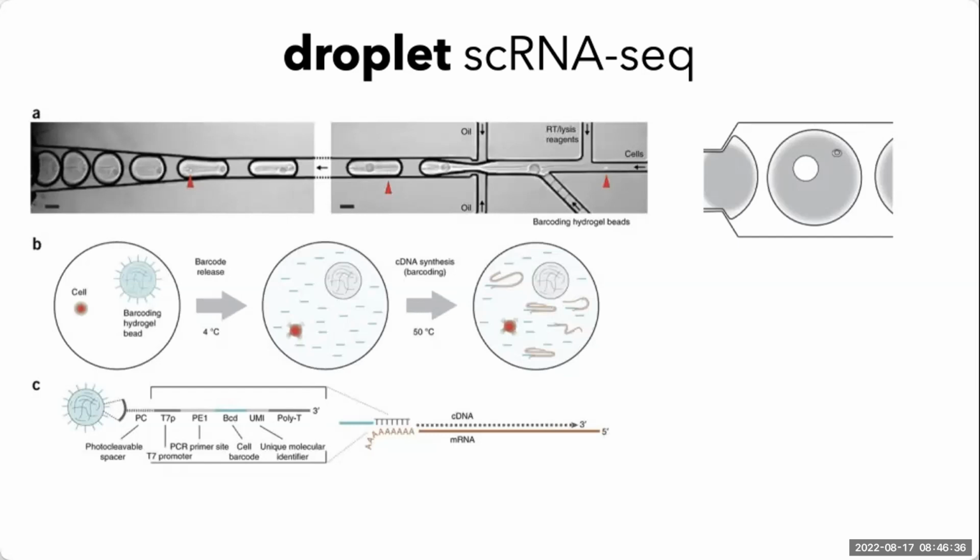In particular, each bead, in addition to this enzyme, will contain a unique barcode, which will be attached to all the reads originating from that specific cell. Thus, all of these droplets can be pooled and sequenced together, and the reads can subsequently be categorized and assigned to the cells of origin based on the specific barcodes that we put into each and every one of these beads.